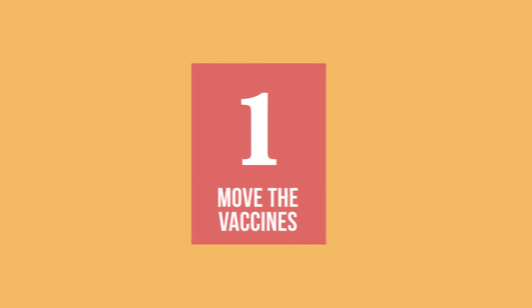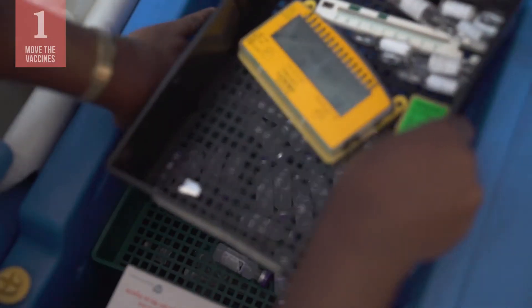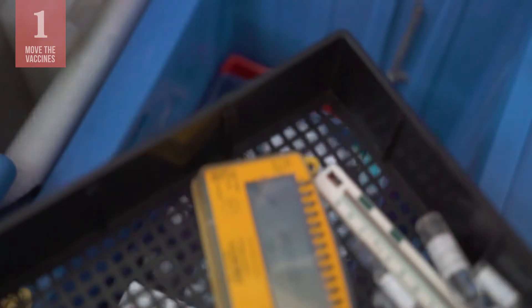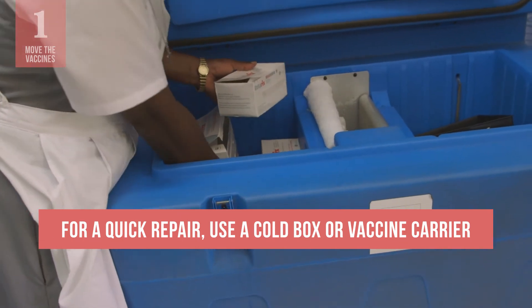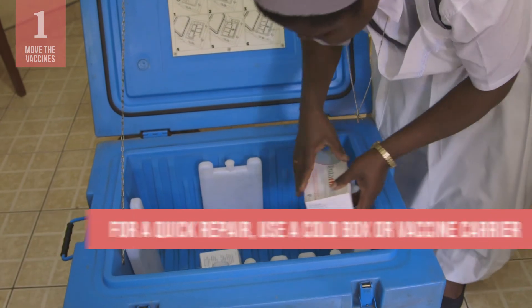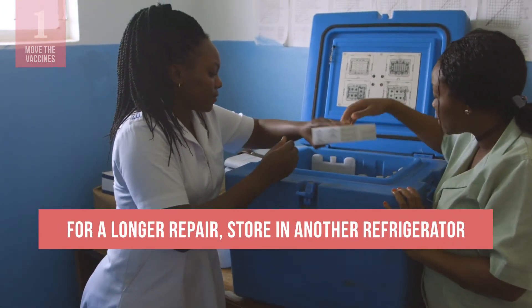In order to protect the vaccines while the refrigerator is repaired, you'll need to move them to other cold chain equipment where they can be kept between 2 to 8 degrees Celsius. For a problem that can be solved quickly, use a cold box or vaccine carrier lined with conditioned ice packs for temporary storage. If you're not sure how long it will take, do that first.